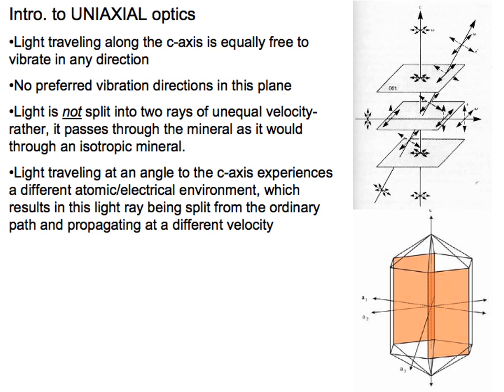So when looking at a microscope slide with many crystals of the same mineral, you'll see many different interference colors as you rotate the stage. And because they're oriented differently, they'll also all turn black at different times with stage rotation. So you need to hunt for one that has the highest order interference colors to try to identify maximum birefringence. And that maximum birefringence is what is characteristic of the mineral and can help you identify it.